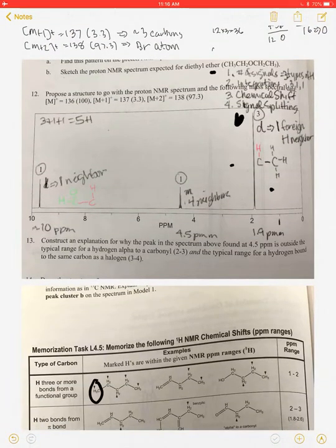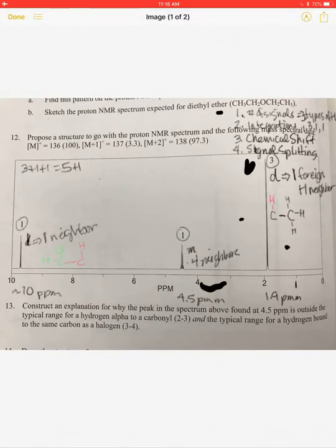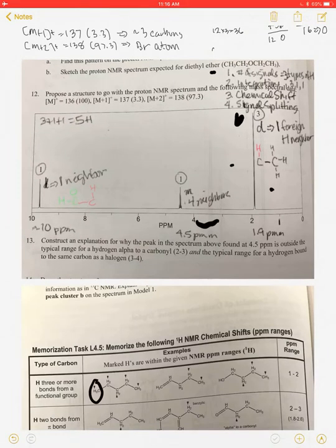Well, when we look at our spectra, it's past 4. It's not between 3 to 4. 3 to 4 would be like here, but that's not where it is. It's down farther than that. So that's interesting. Okay, so remember that chemical shifts are additive. So maybe the carbon that has the bromine and the hydrogen, maybe it's close to another functional group.